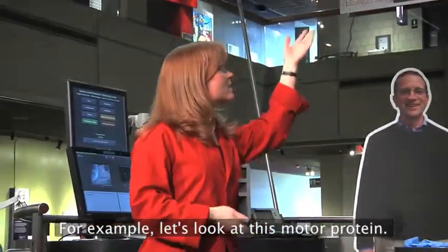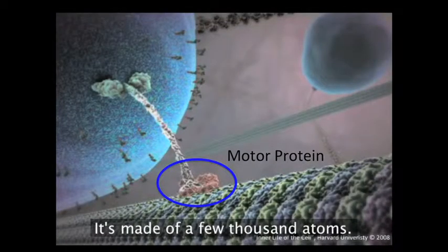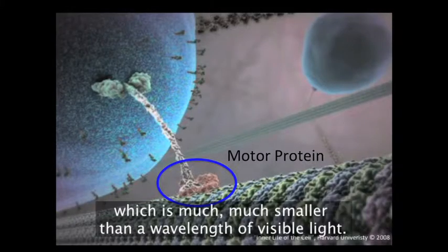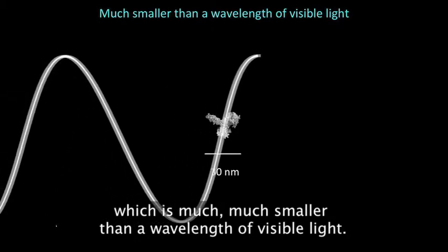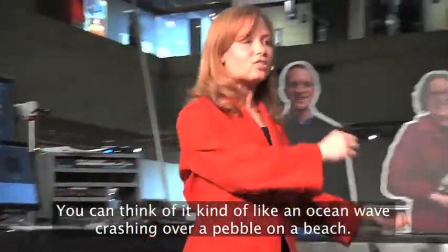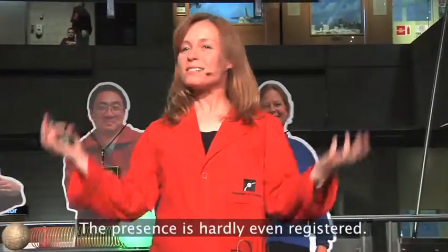For example, let's look at this motor protein. It's made of about a few thousand atoms. It's about 30 nanometers in size, which is much, much smaller than a wavelength of visible light. You can think of it kind of like an ocean wave crashing over a pebble on a beach. The presence is hardly even registered.